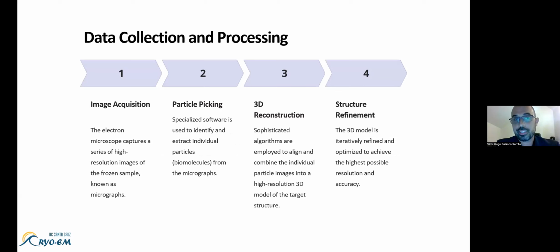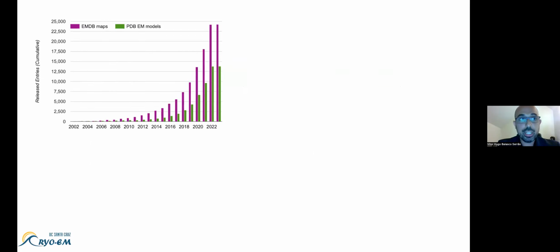So the national facilities are here to help us majorly with image acquisition and also provide support for the downstream process. But it's also very, very important to optimize this workflow. The screening facilities help a lot to make the sample image appropriate. So you go over there with your grid ready to go after you do a bunch of screenings and understanding how your data collection must be done. So I just would like to highlight the importance of having the sample ready to go.